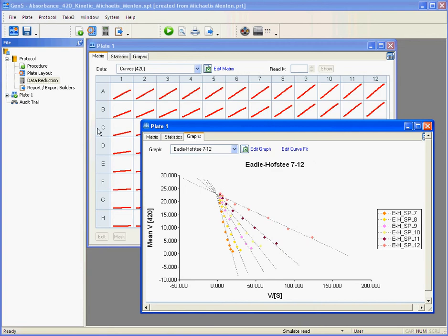There is another new tool available in the data reduction area that greatly facilitates the creation of complex or simple transformations.